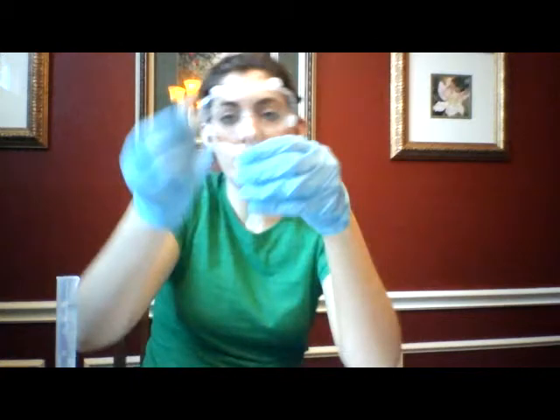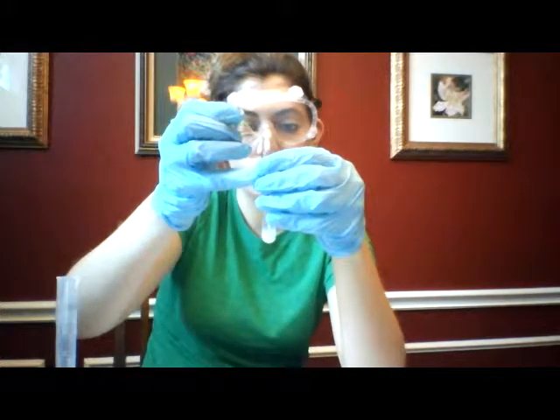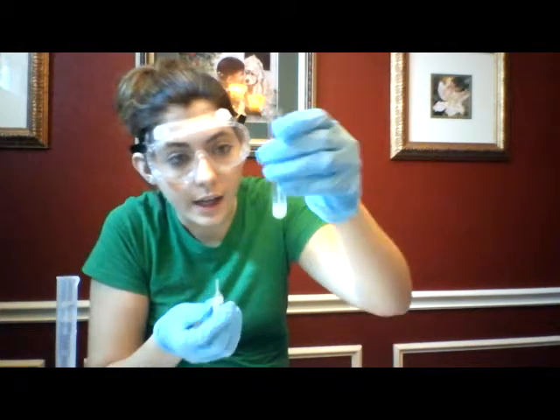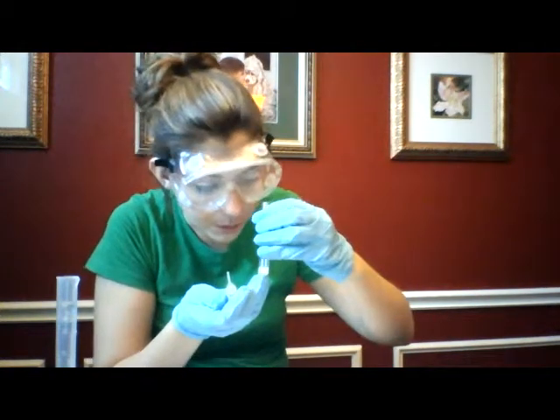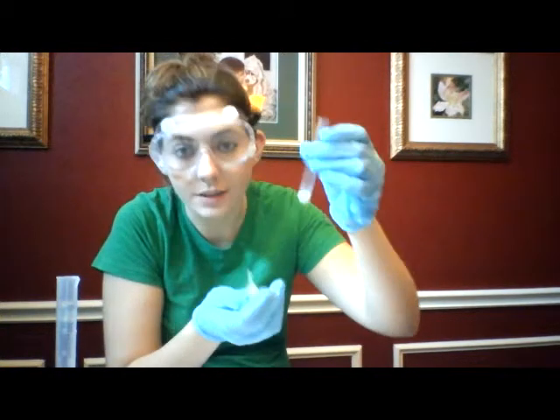And that appears to have broken up the precipitate a little bit, it's a little bit clearer, but then it's still there. It didn't completely dissolve it.